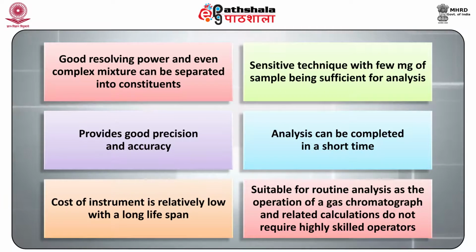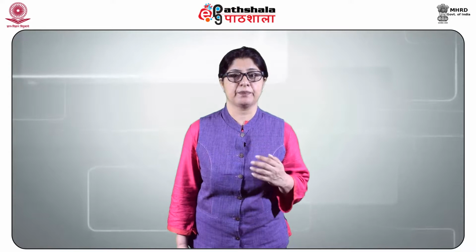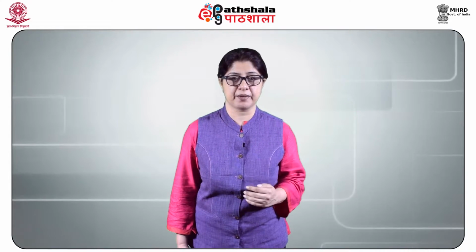The technique is suitable for routine analysis as the operation of a gas chromatograph and related calculations do not require highly skilled operators. Gas chromatography is at present the most widely used and powerful tool available for separations.